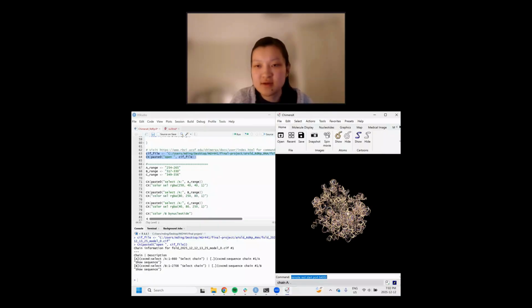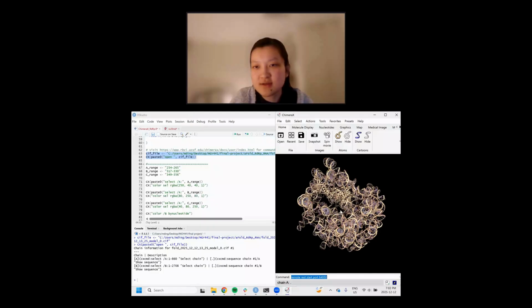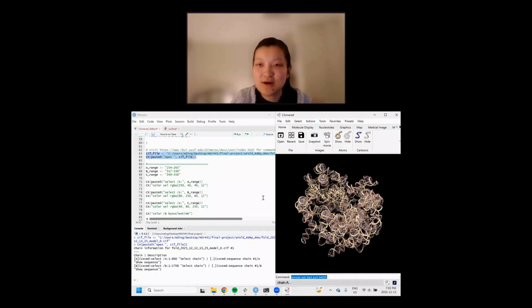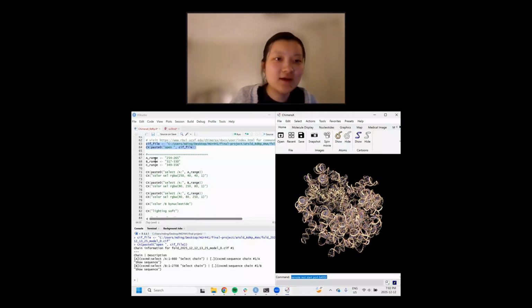So this looks sort of funky because I actually input both the RNA genome for my virus and the RdRp sequence into AlphaFold, just because the RdRp interacts with the RNA sequence. This may not be entirely accurate, of course, because there are a bunch of other factors going on in biology that dictate how these two special molecules interact, but it's sort of interesting anyway.